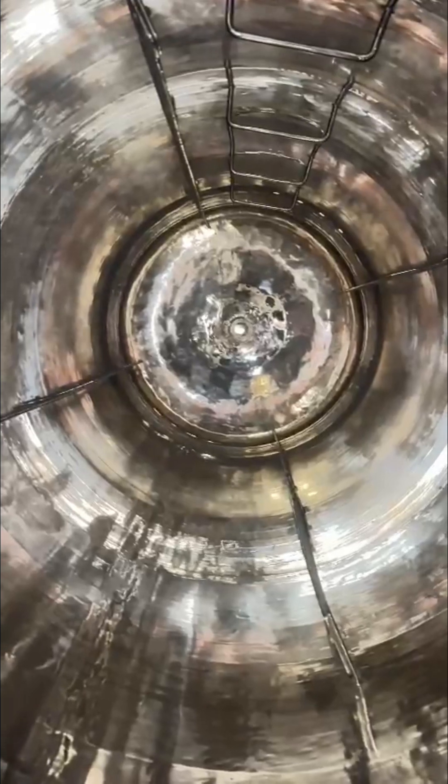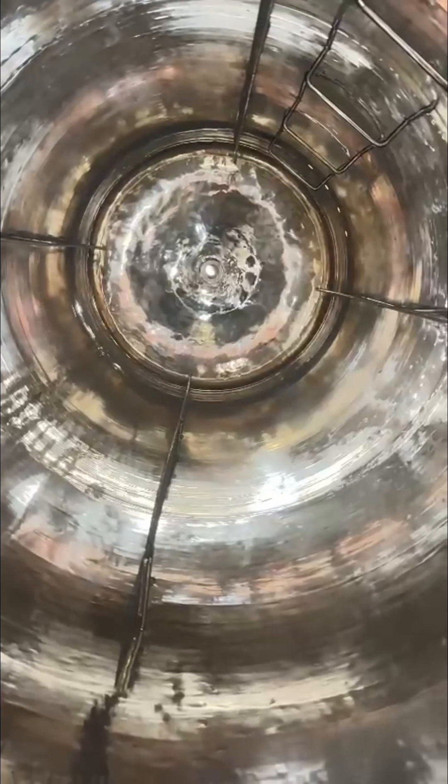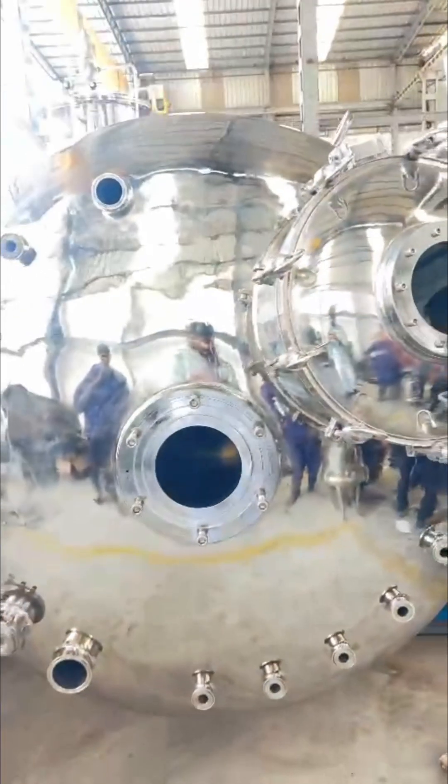Both the interior and exterior surfaces are electropolished to an exceptional finish of less than 0.4 RA. This flawless surface quality ensures a clean, seamless contact area for microorganisms to thrive, which is essential for bioprocess applications.